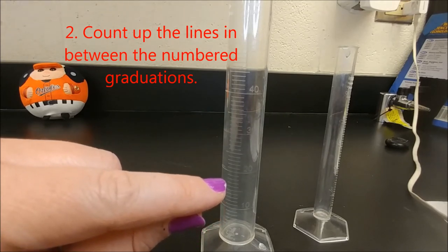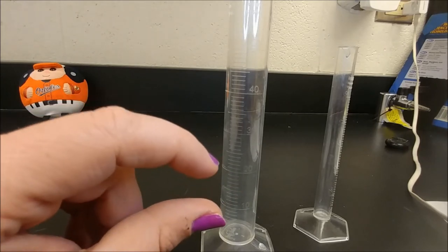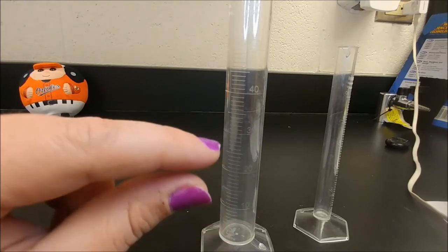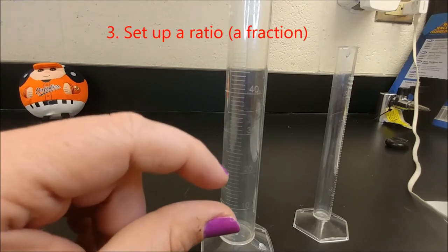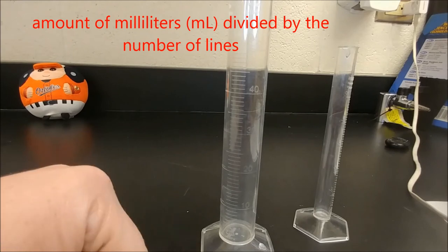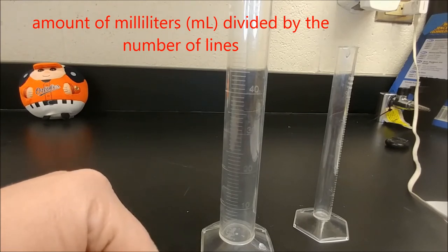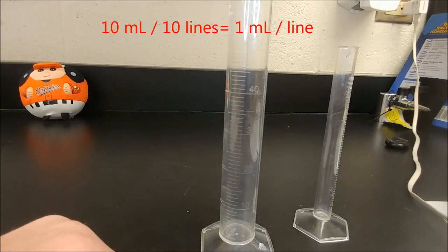...six, seven, eight, nine — don't forget the last one, which is ten. So there are 10 lines in that space. The next step is to say: 10 lines divided by 10 milliliters — that means each line is worth one milliliter.